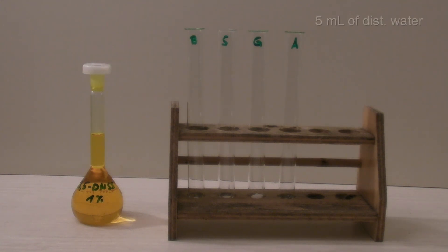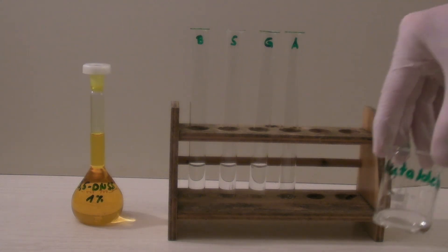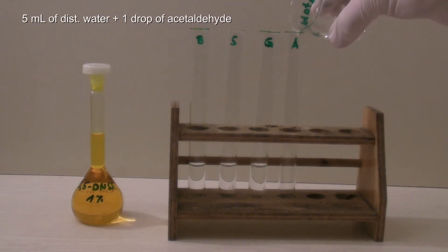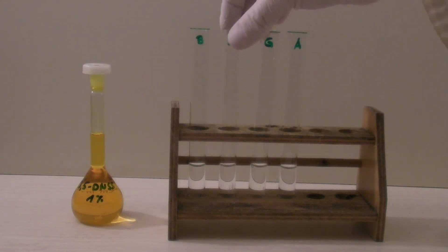Then, 5 milliliters of distilled water were added to each test tube. To the last one, 5 milliliters of distilled water containing a drop of acetaldehyde were added. The tubes were shaken to dissolve the sugar.